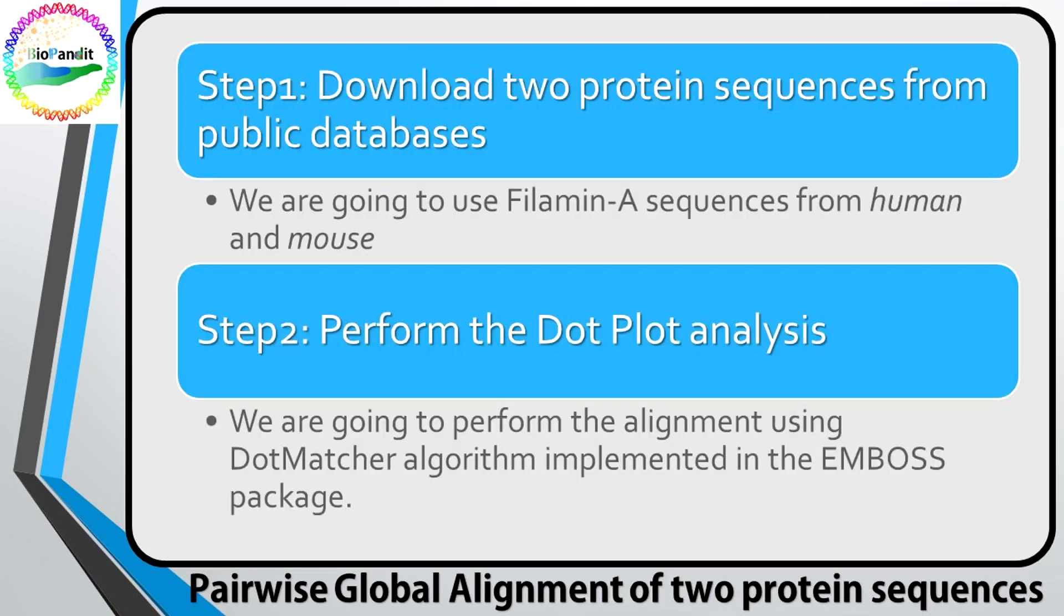This analysis has two parts. First, we must download some protein sequences from public databases. We are going to use human and mouse muscle protein philamine A sequences. The second part is to perform the dot plot. There are multiple standalone software tools and online servers for this analysis. We are going to show you the use of dot matcher algorithm implemented in the emboss package.